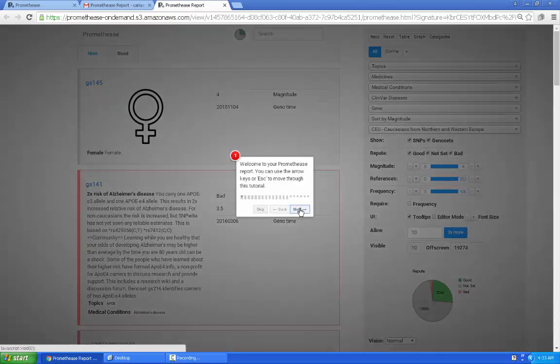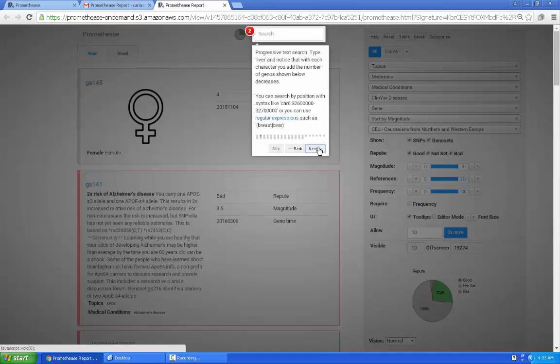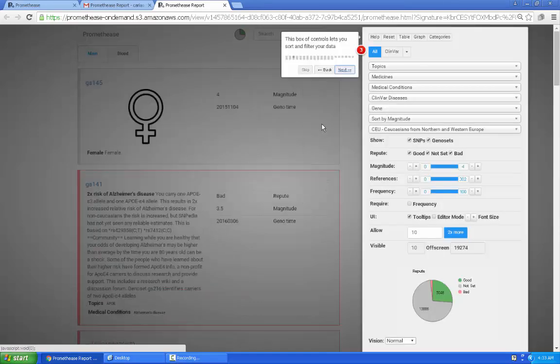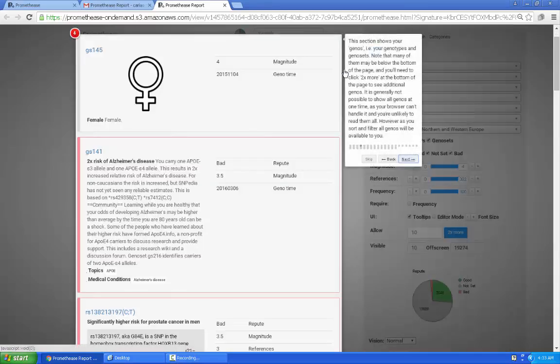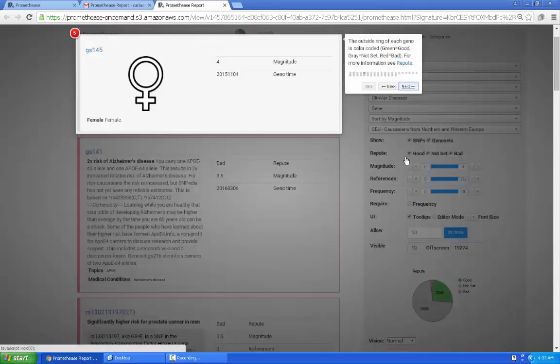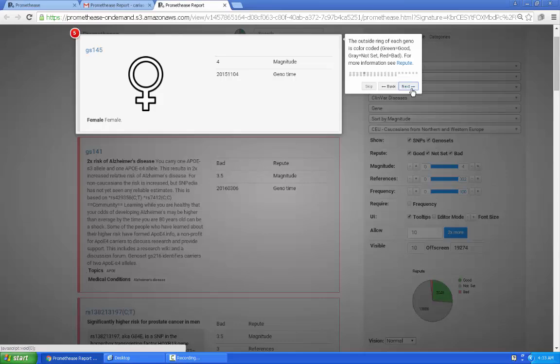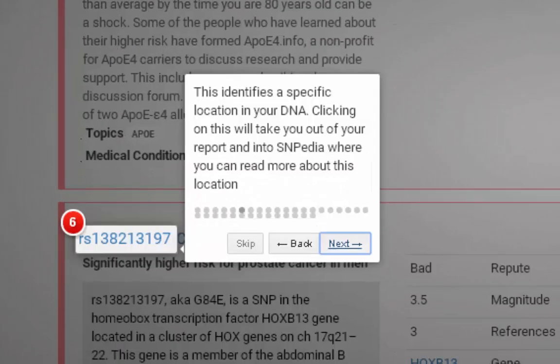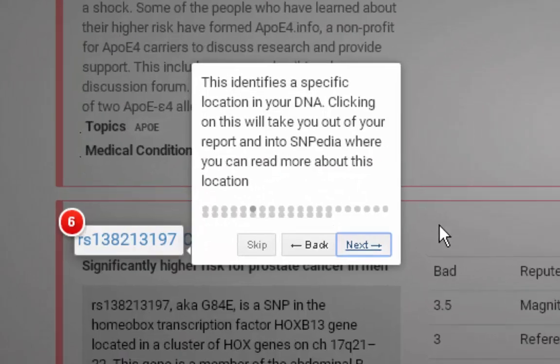The tutorial walks you through various steps like text search, all of the controls, all of the genotypes, information about links out to Snipedia for the SNP as well as the genotype.